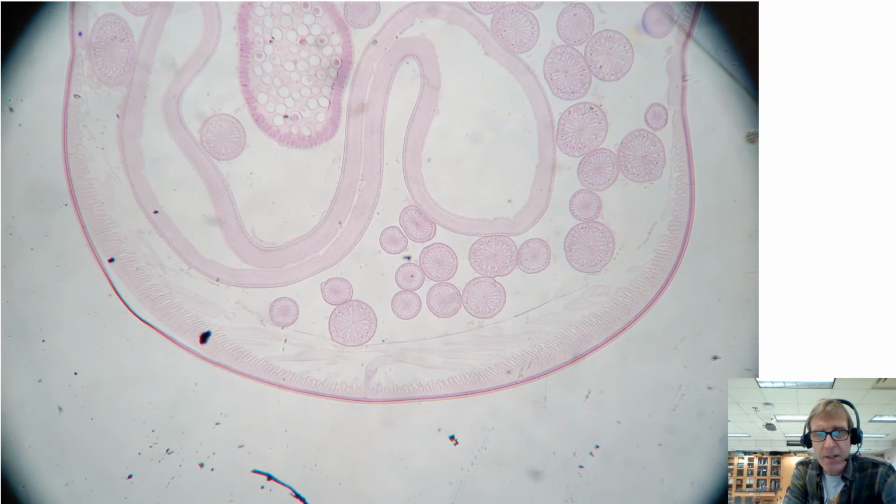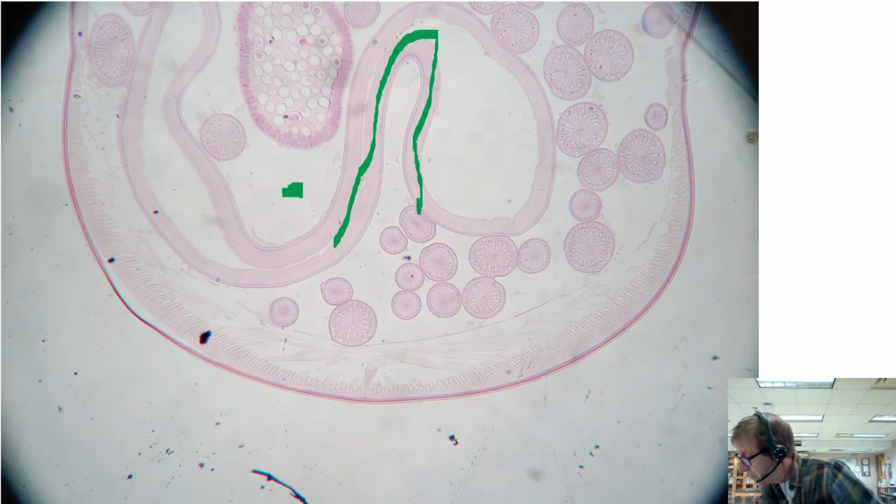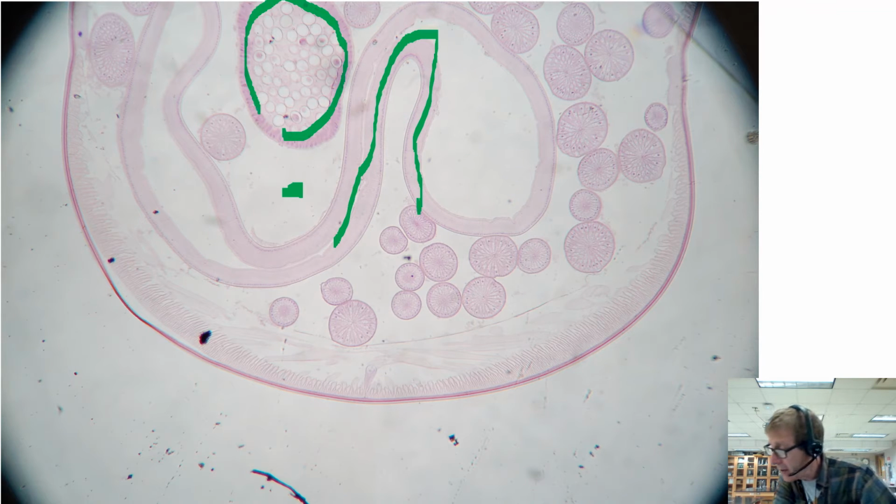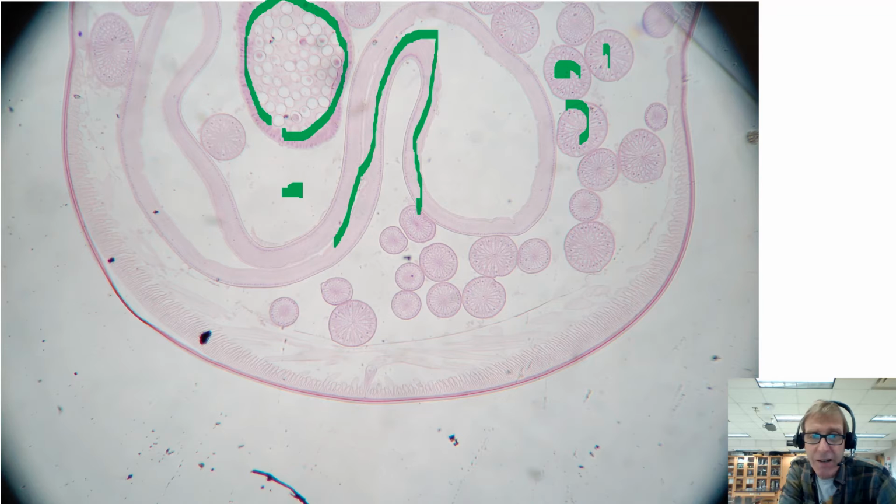This is on the same slide. Your cross-section slide has a male and a female. This one is a female, and again, you see the large intestine here, the pseudocoelom here, and this is packed full of eggs. Those are oocytes in there. And you'll probably see a lot of these little tubes here are oviducts carrying out the eggs.